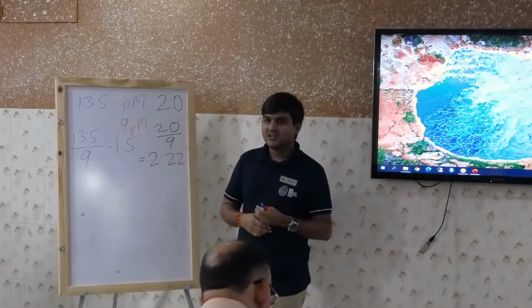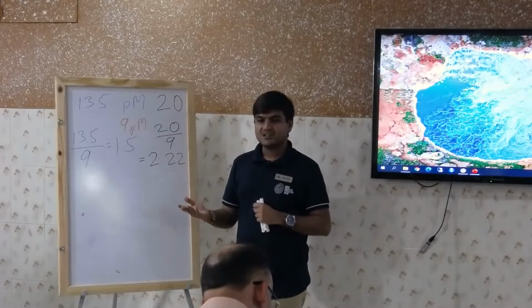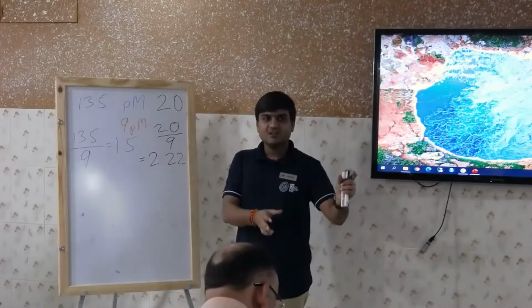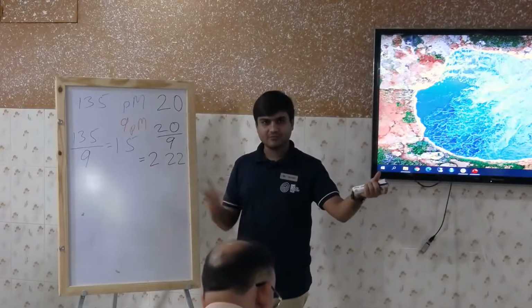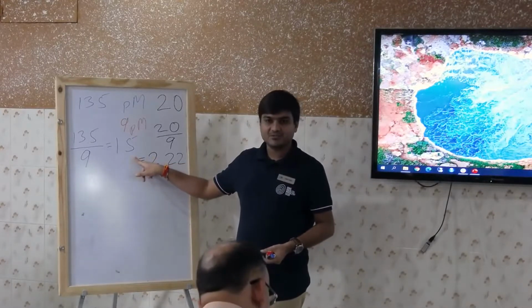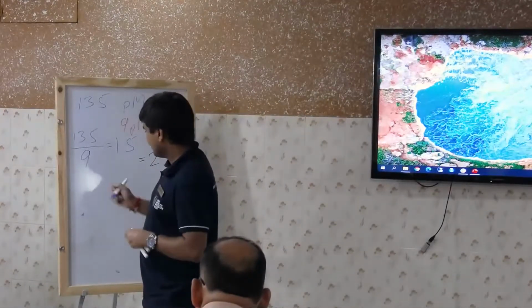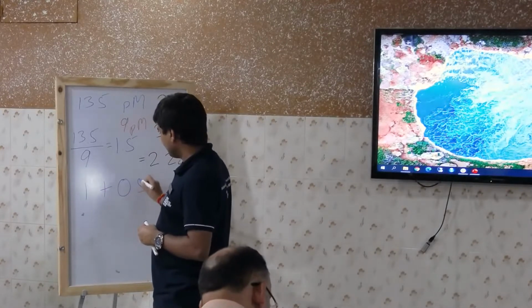Right? Now whenever we say we are diluting 10 times, that means 1 part our stock and 9 part buffer. When we say 2 times dilution, that means 1 part of stock and 1 part buffer. Similarly, when I say 1.5 times, this means that my library will be 1 part and my buffer 0.5.